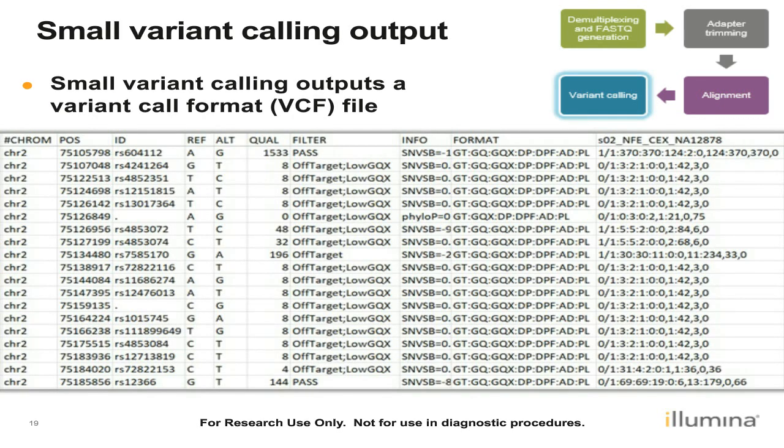All right, so here we have a typical VCF file. And we're going to go through each column and break down what it's showing us. So we first start with the position of the variant, and this is defined in two columns. First, the chromosome column, telling us what chromosome it's on, and then the position is the coordinate, so the single base position where we're finding that variant.